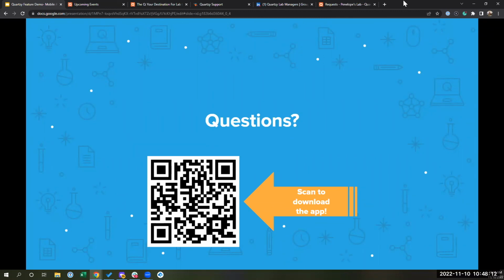Excellent. And Matthew clarified his question on the OM barcodes. So he's talking specifically about a barcode that is already printed on a product. So could they use that barcode that's on the product to mark it received?